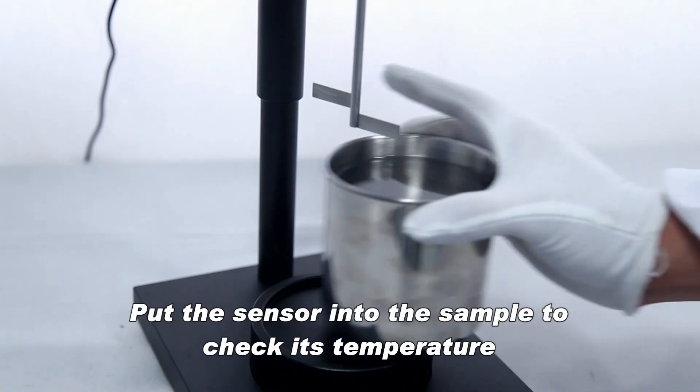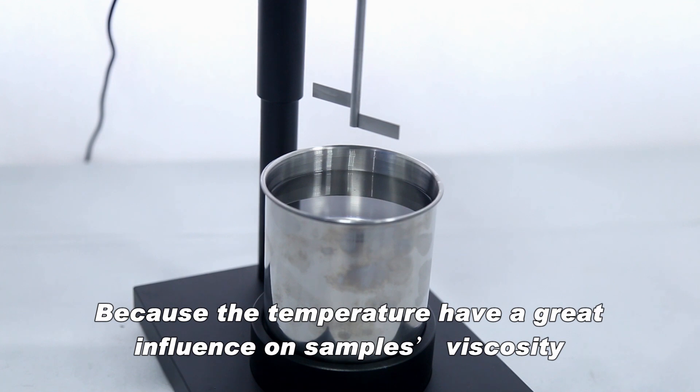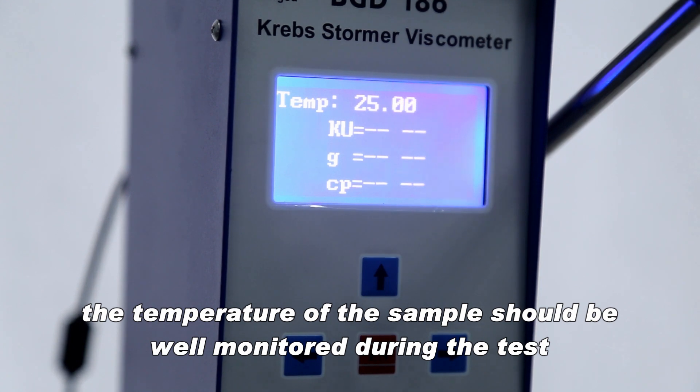Put the sensor into the sample to check its temperature. Because temperature has a great influence on the sample's viscosity, the temperature of the sample should be well monitored during the test.